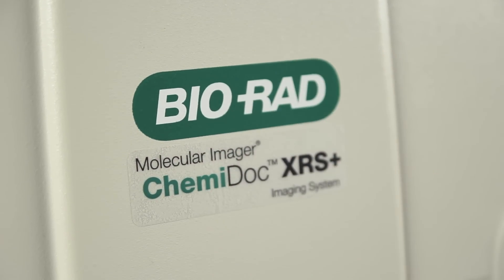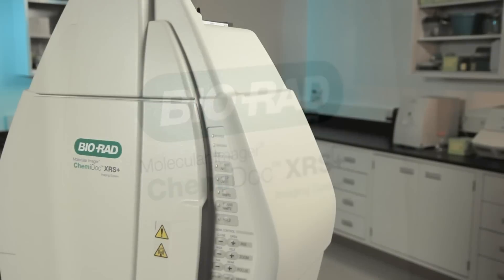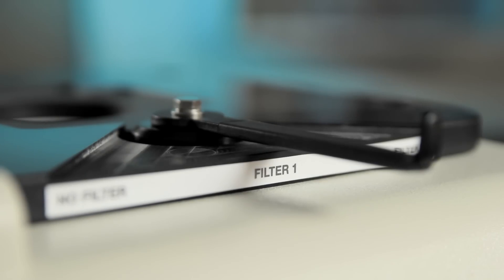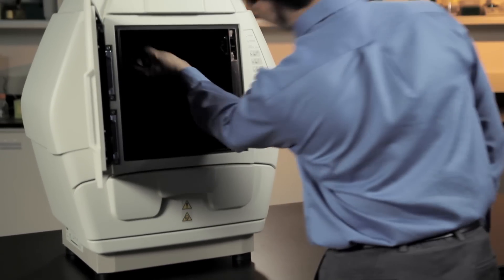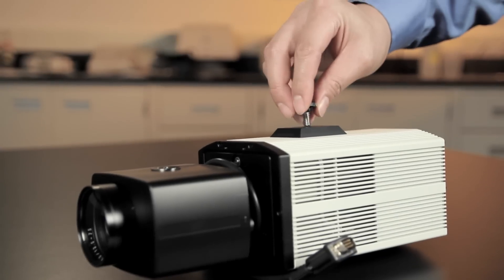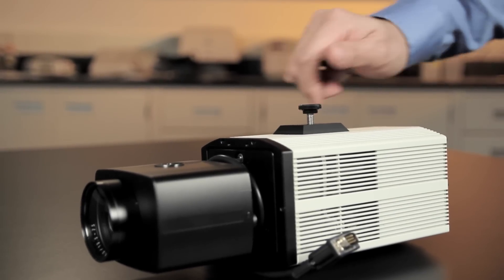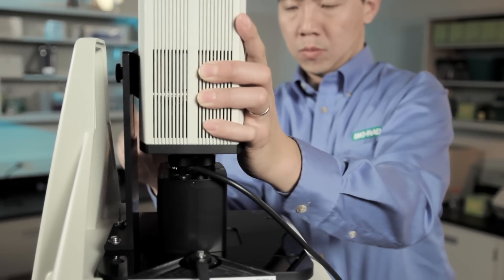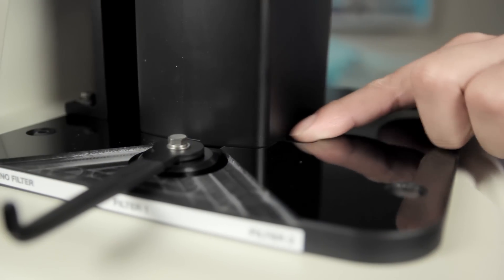Then place the ChemiDoc sticker on the door. To install the filter, move the filter slider to position one. Take the standard filter and screw it into the filter holder below the circular opening in the hood. Install the mounting screw for the camera and slide the camera into the camera mount. Ensure the black camera lens is fully seated on the gasket.